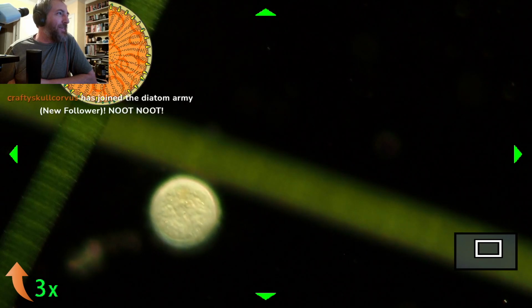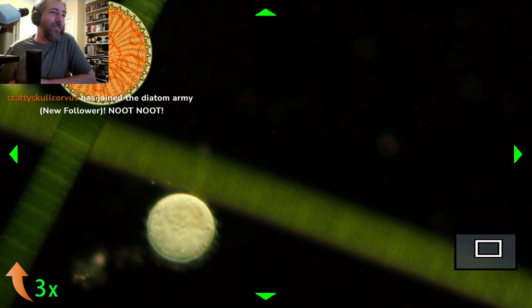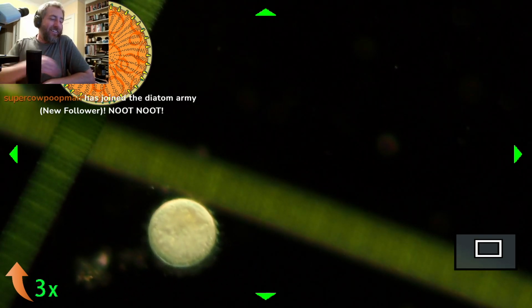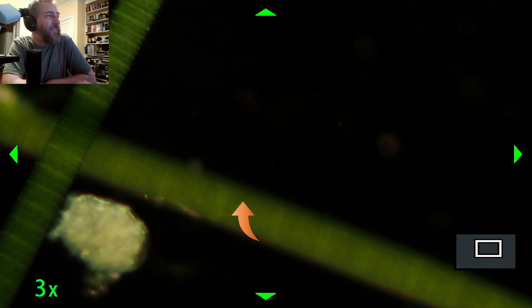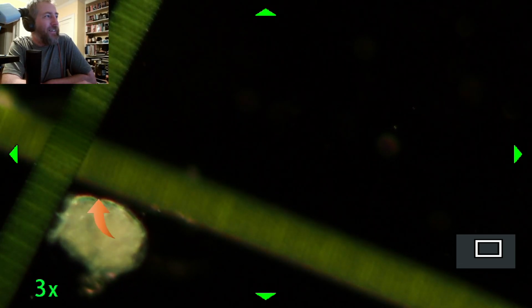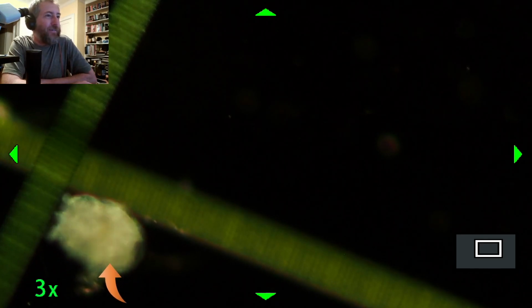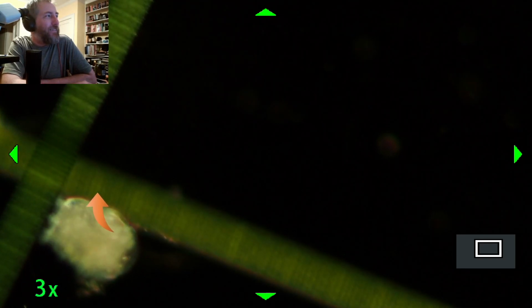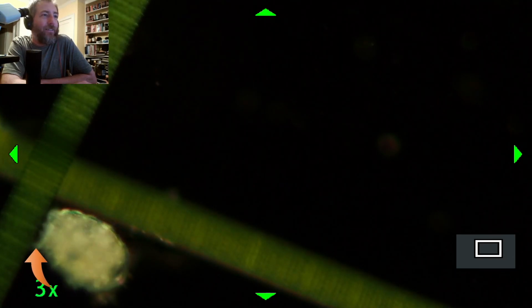We're looking at some live organisms in the microscope. And this one just likes to spin. It's a ciliate. Good news, everyone. The green thing you see right here is an algae, oscillatoria. And I guess you didn't realize this, but it's not just a circle. It's like a bag. I knew that. I was waiting for it to reveal itself. From the top, it was just spinning, and it looked like a circle. In fact, it's a ciliate that's sort of bag-shaped, and the top of it is surrounded by a ring of hairs.